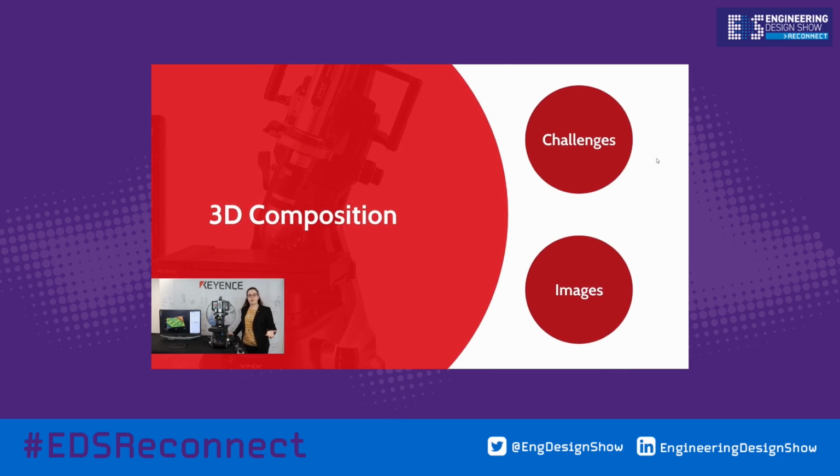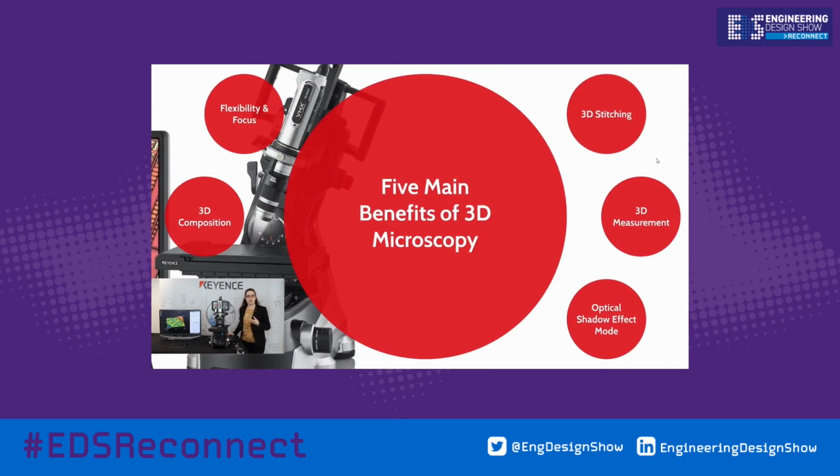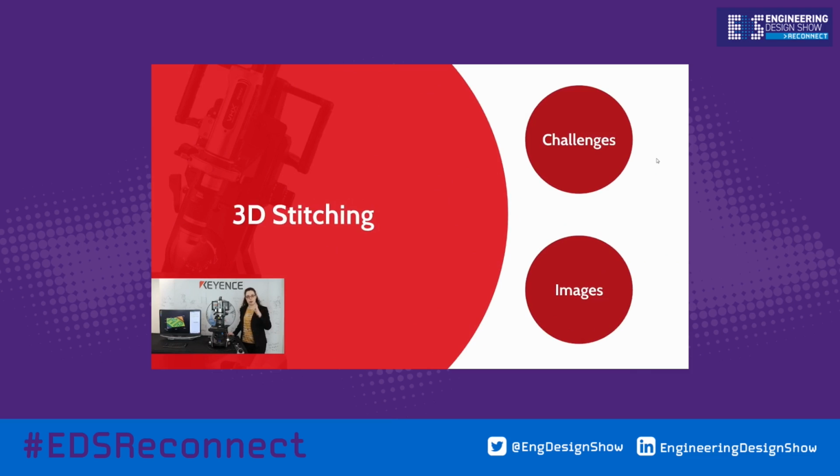Okay, so that's general 3D composition. That gives us a 3D in one field of view. But sometimes we might want to zoom into a higher magnification, get a bit more detail. But the problem with that is that the more you magnify, the smaller your field of view becomes, and so the less of the sample you can actually see under the microscope.